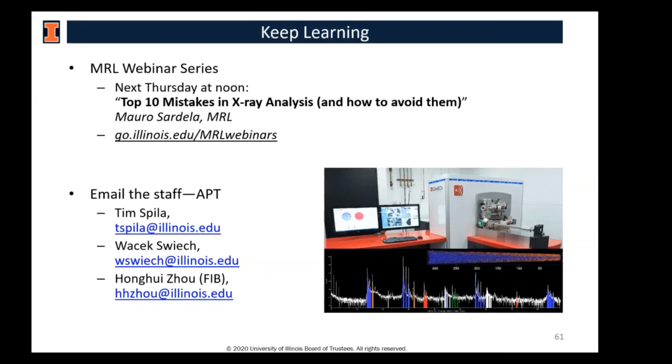It is a relatively slow technique. The atom probe tip preparation by focused ion beams is kind of similar to that of TEM sample preparation by FIB as well. So everything depends on how skilled and experienced the person making these tips is. It can take maybe even half an hour or so, typically an hour or 2 or 3 per tip. And then measurement also depends on how much of a tip you would like to reconstruct.